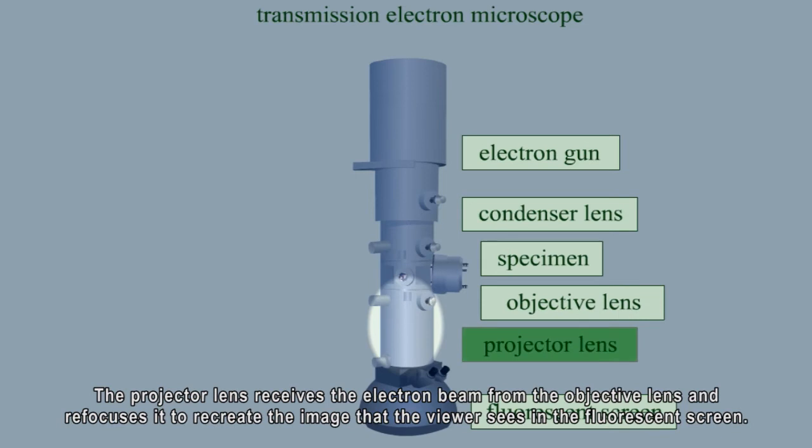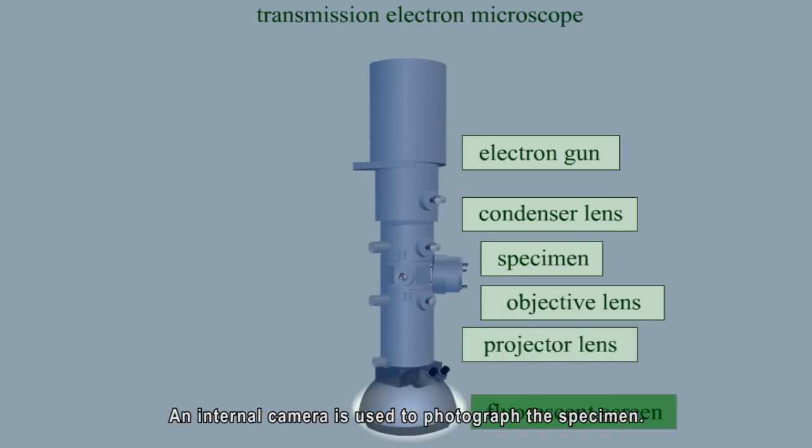The projector lens receives the electron beam from the objective lens and refocuses it to recreate the image that the viewer sees in the fluorescent screen. An internal camera is used to photograph the specimen.